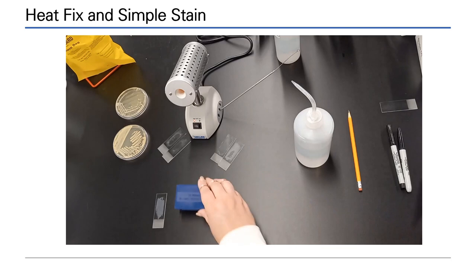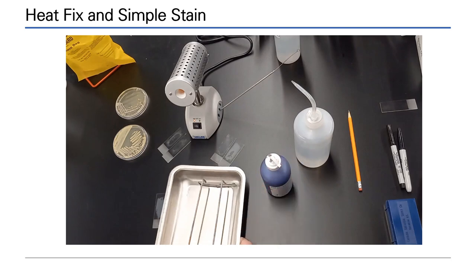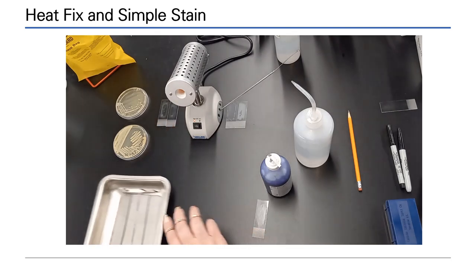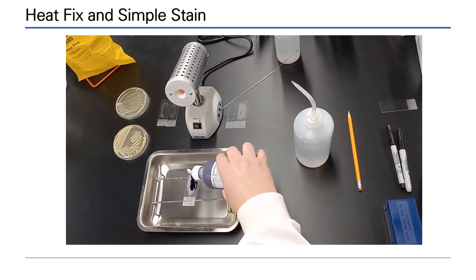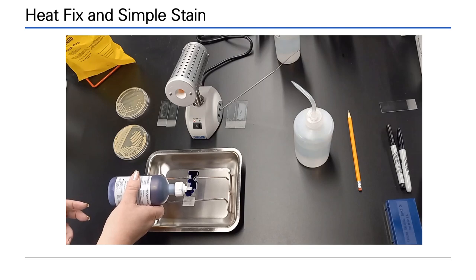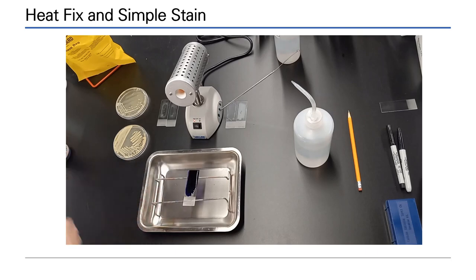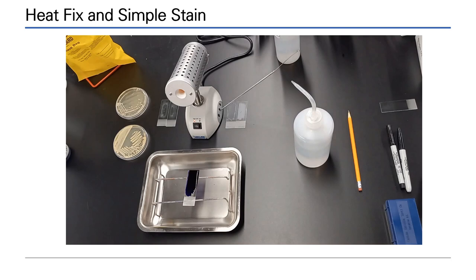To perform a simple stain, tidy your bench and place your staining rack in the center. You do not need to work in the aseptic zone because heat-fixation has now killed all of the cells on your slide. Crystal violet is a basic stain. Perform the simple stain by flooding the specimen with the dye. Stain for one minute. During this time, the basic dye will cross the cell wall, staining the peptidoglycan layer purple. It will enter the cell cytoplasm and also stain it purple. This is a simple stain that provides contrast.